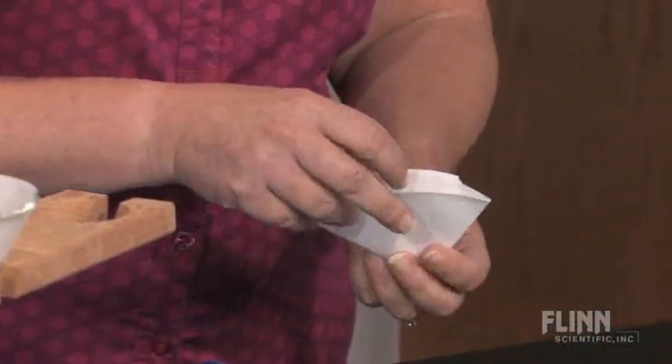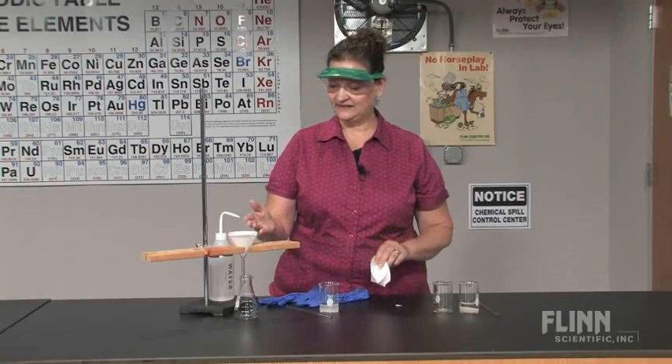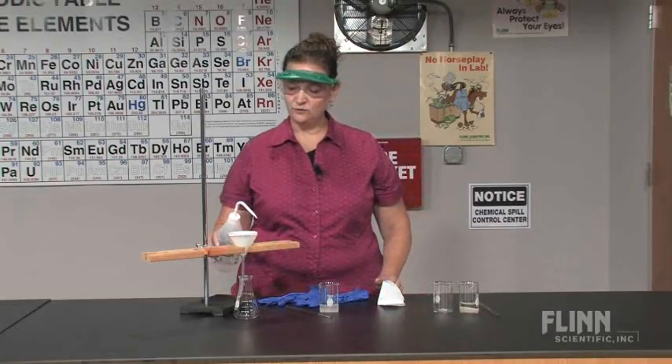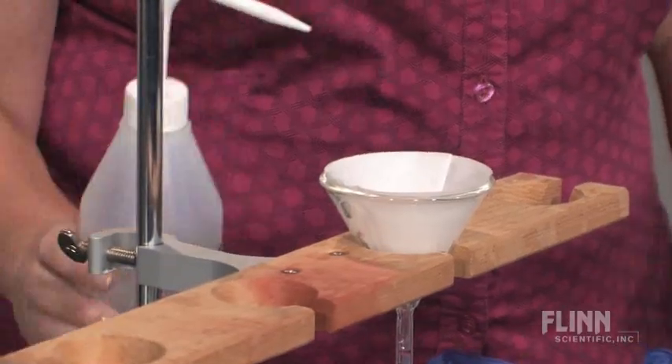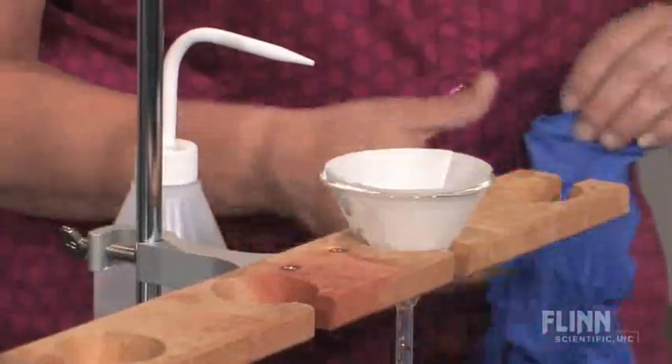Then pull one side out to form a cone. Now you're ready to put it in the funnel, and then you want to wet the funnel slightly with some distilled water, again to help the paper lay flat against the side of the funnel.